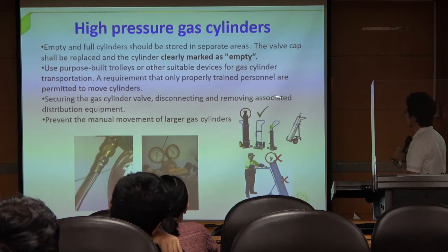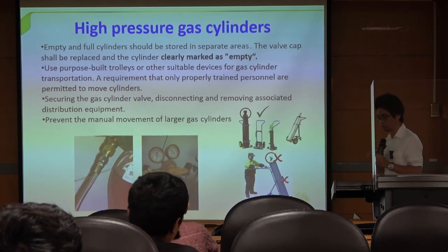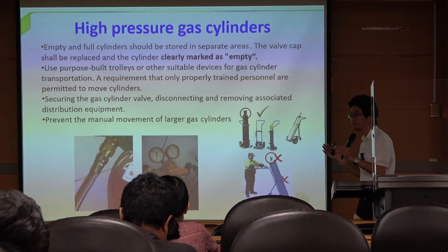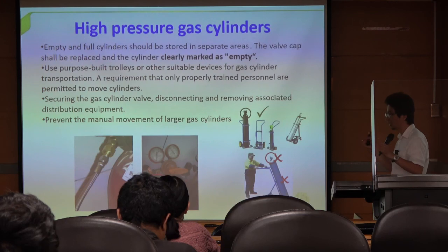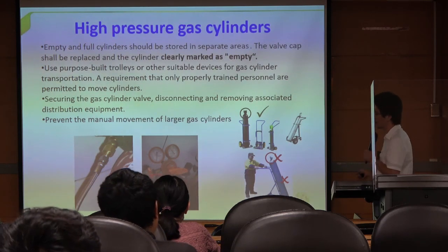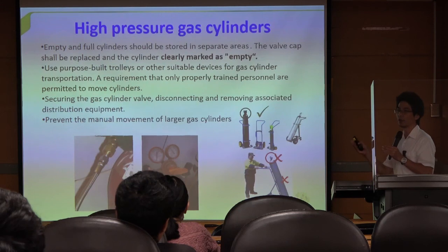And if you want to transport the cylinders, use equipment. You all see the suppliers when you buy new cylinders, they will transport the cylinders like this one, right? The workers will use their hands to rotate the cylinders all the time, with two cylinder tanks. Don't do that, because they are professional. They work every day, but you are not like them. So use the machines to transport your cylinders.